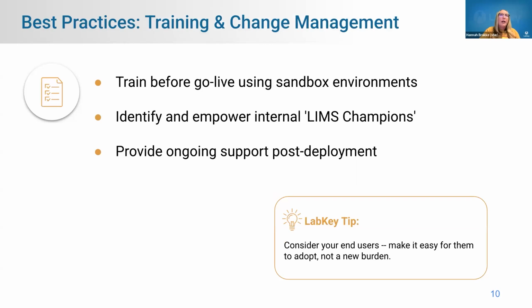And so the last one here is around training and change management. This is the thing that I think gets ignored probably the most during LIMS implementations, mostly because we're so focused on all of that other stuff that training and change management can be kind of an afterthought. And so that's something that our LabKey services team is definitely bringing to the forefront to make sure that we have that built into that implementation, because you want to make sure that you're training your users before you go live into a production environment.